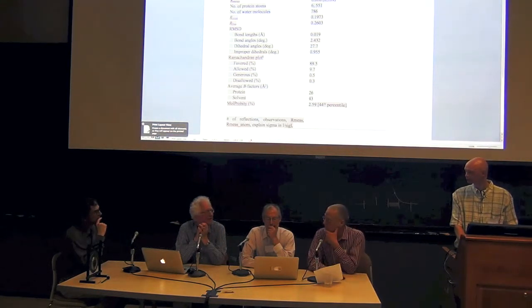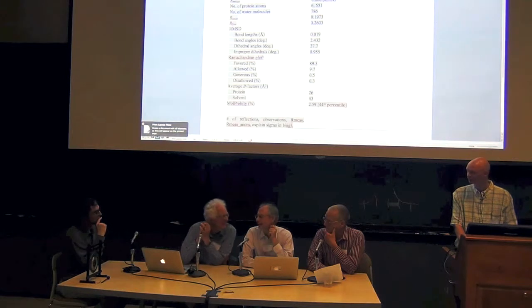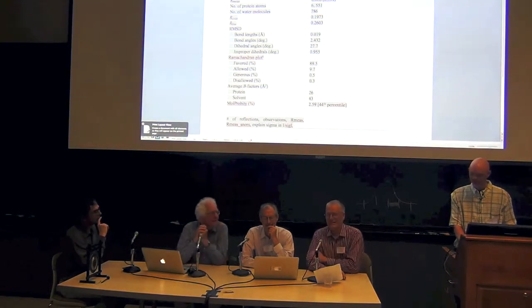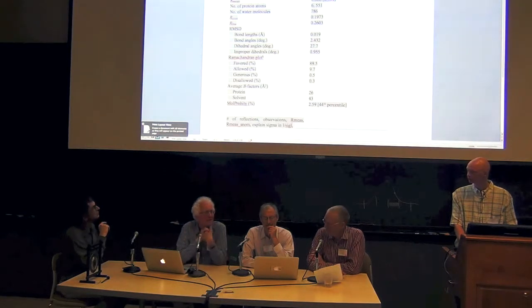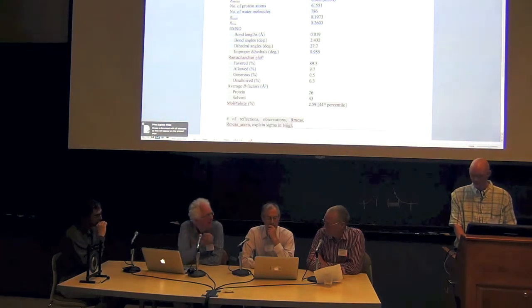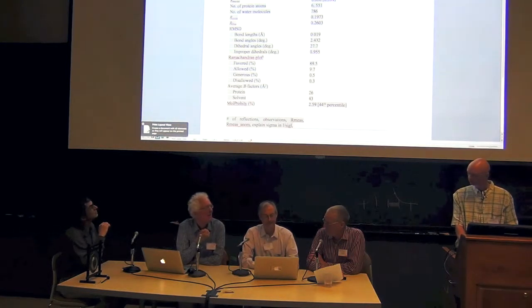PDB won't take anything. And in fact, they always go above 150%. At least in the position I use. Anyway, I'd like to backtrack a little bit and ask who is supposed to be reading Table 1 and what are you supposed to take away from that. And there are two audiences. One is the referee, and for the referee, this is really inadequate information to tell anything. And I really like some maps, actually.